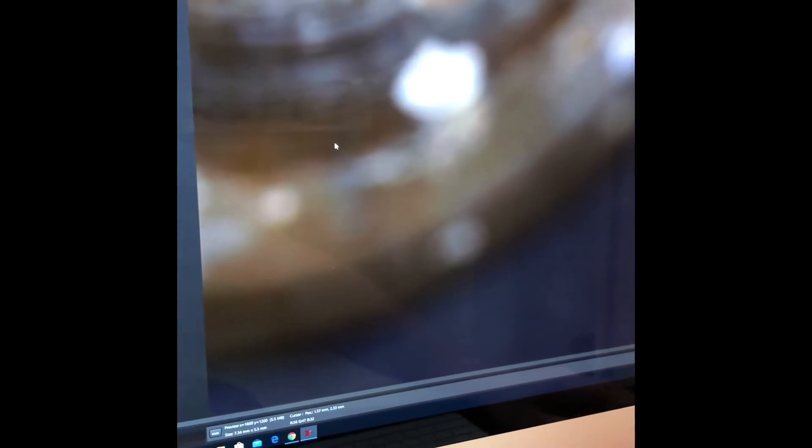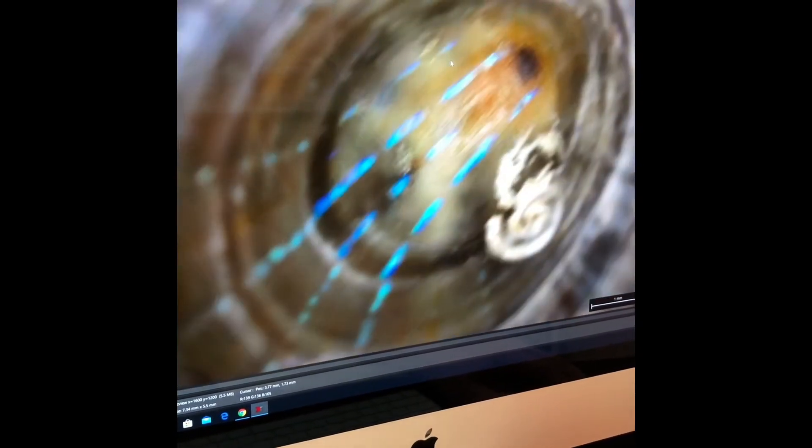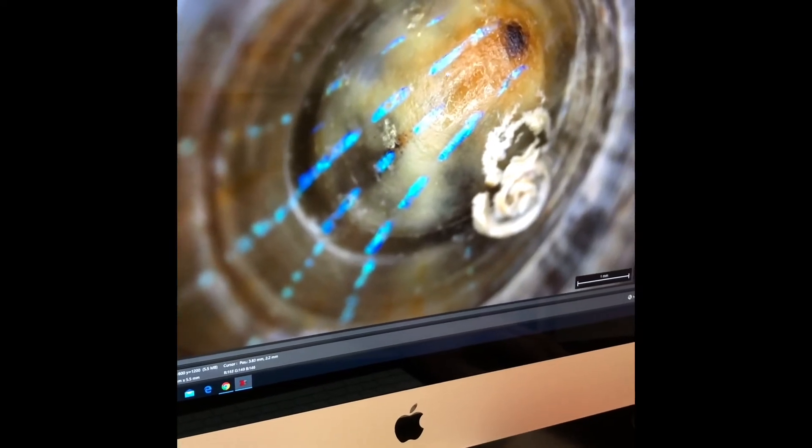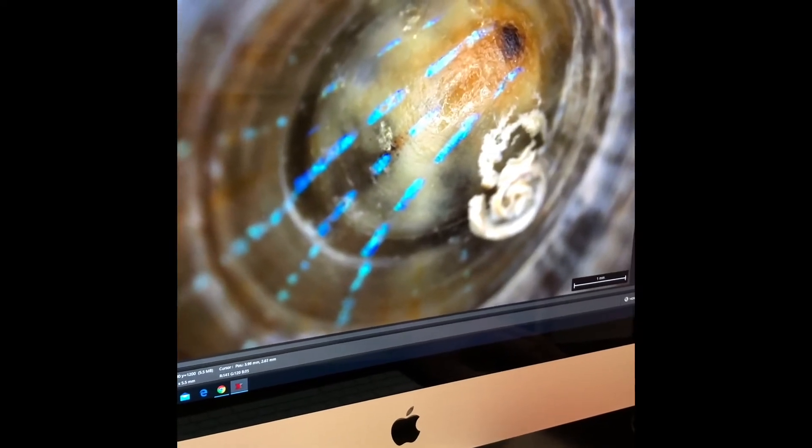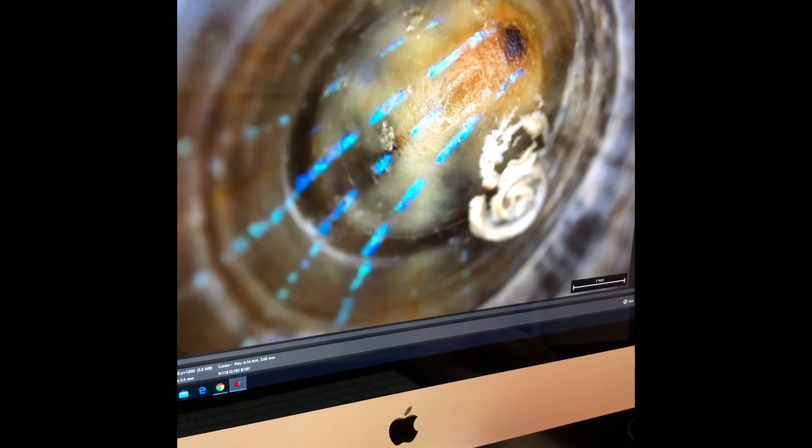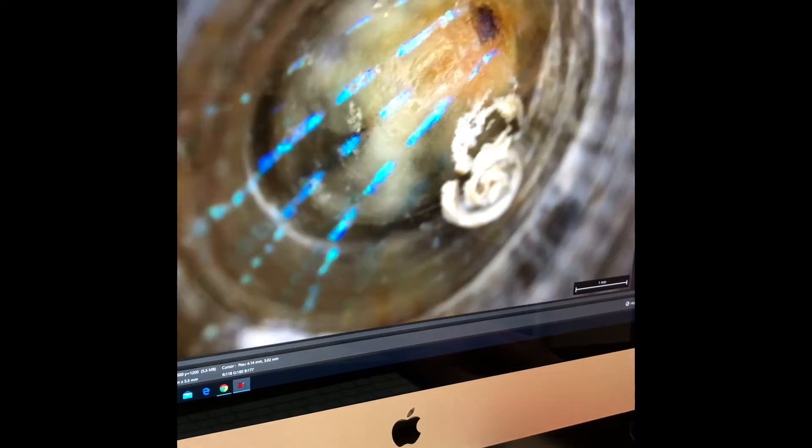Or we can double click. When you use the double click feature, wherever you double click becomes a new center. So now we have this pretty iridescent region as our center point.